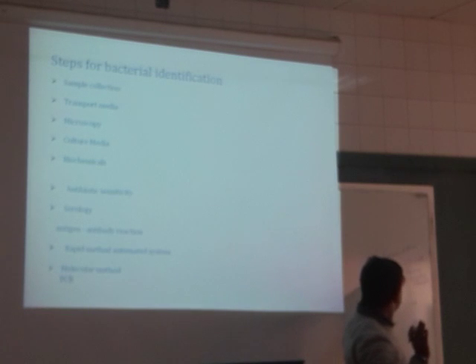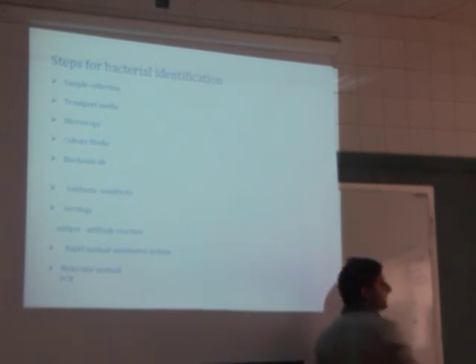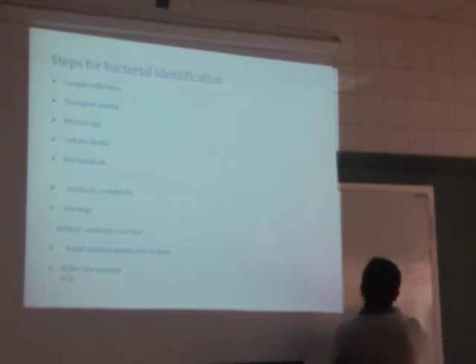And for sugar fermentation. And second, in the biochemicals, some microorganisms produce enzymes. These are called the enzymatic tests. These are called catalase, tryptophanase.